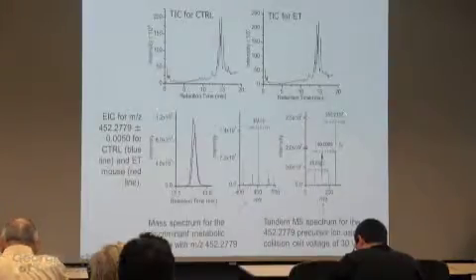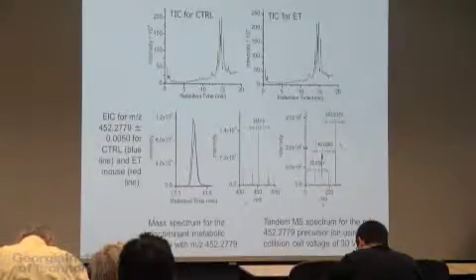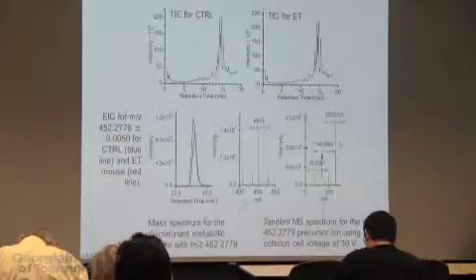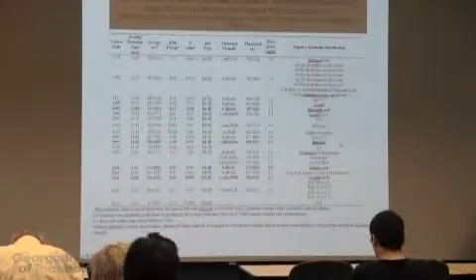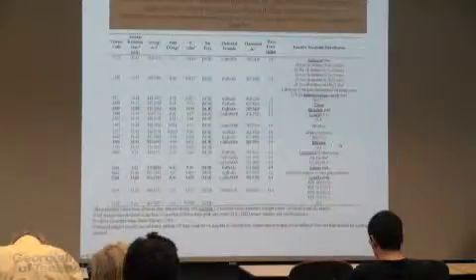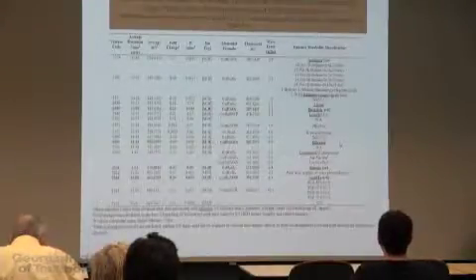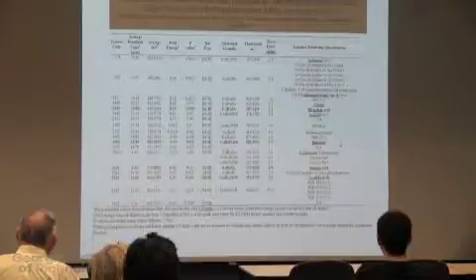So sometimes you may search a database and get a match. That's great. But if you don't get a match, you're going to have to look at what potential molecules match this elemental formula, and then see if that molecule would match this tandem mass spectrum. Okay, so it's a pretty tedious process. So it's so tedious that you're going to understand why I show these tables. So they teach you in kindergarten of PowerPoint not to show tables. This table took us a year of work. So I am going to show it to you, like it or not, because it was so much work. Okay, we're very proud of this table.